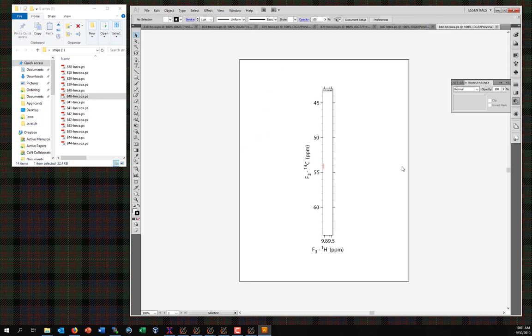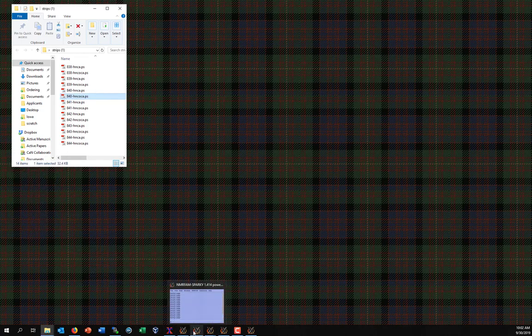What we're going to have to start doing, though, is putting these all into a single document. That's interesting. Okay, that looks legit. 39 HNCA, 39 HNCOCA. That looks fishy. We might have to make some of these again. But that's okay. It's what we're here to learn. I'm trying to channel my inner Bob Ross. Okay, let's go back into our Sparky.